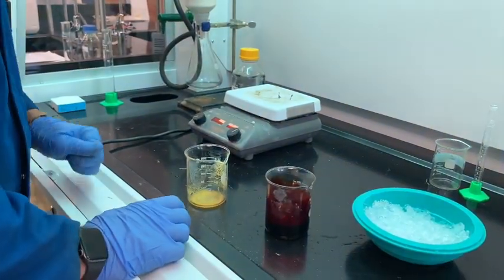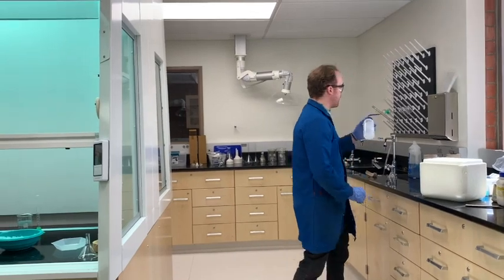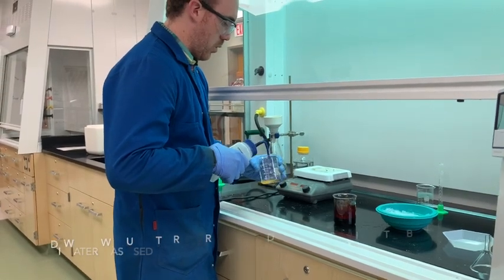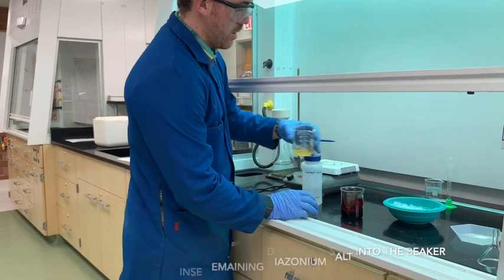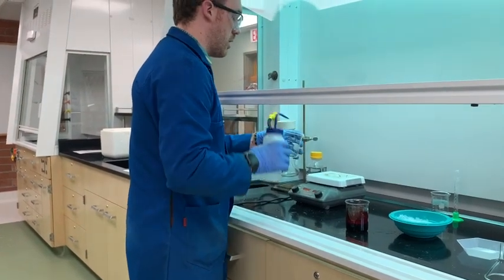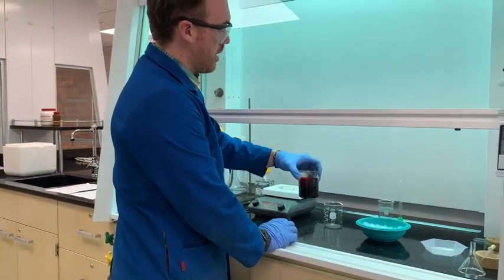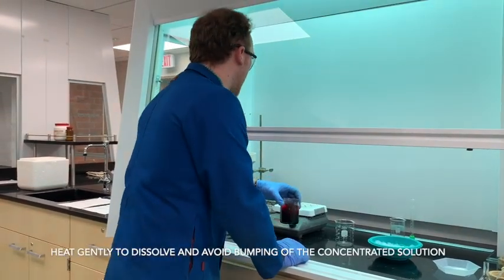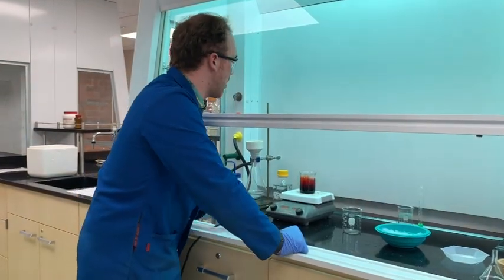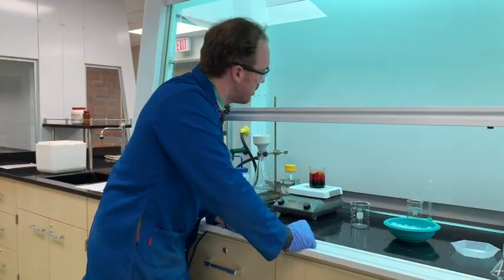In the meantime, I'm going to get a wash bottle full of DI water just to rinse this into the solution. Don't want to lose any of our product that way. As you can see, it's quite a dark solution, so you definitely don't want to get it on your clothing. It's not coming out. Then we got all of our salt into that mixture so it all reacts. And we're going to let that heat for just a second in order to make sure it fully reacts. If you take a close look, it looks quite dark, almost like a red. Almost evil, like an evil hue to it.